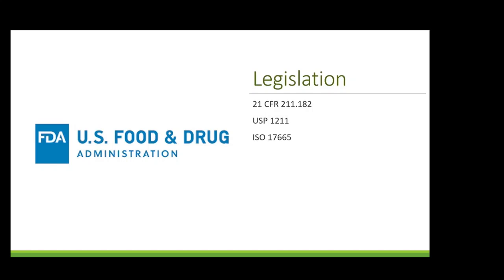FDA Regulation 21 CFR 211.182 details equipment cleaning, use logs, and validation requirements. USP 1211 describes the basic principles for validation and certification of sterilizing processes. ISO 17665 specifies requirements for development, validation, and routine control of a moist heat sterilization process for medical devices.